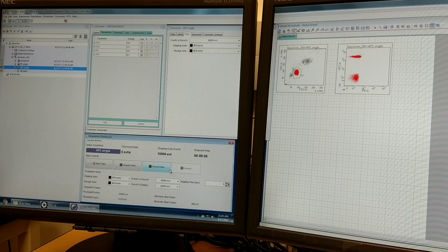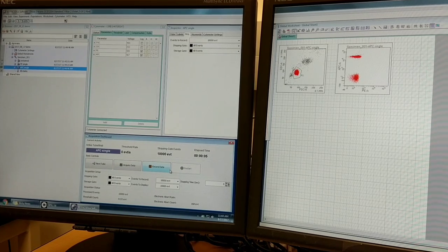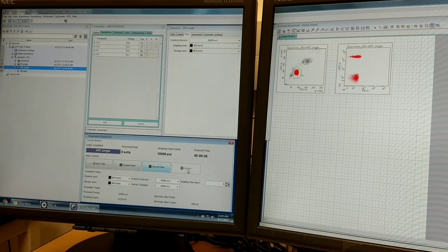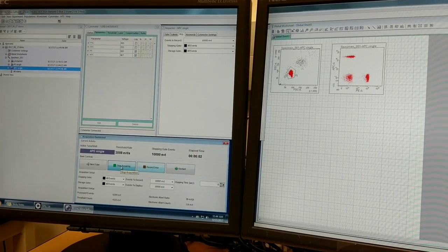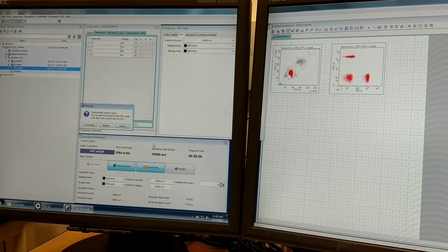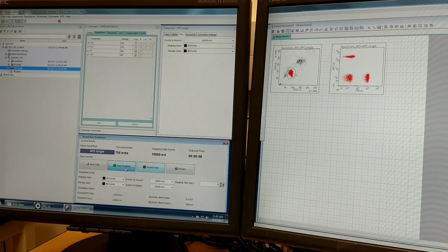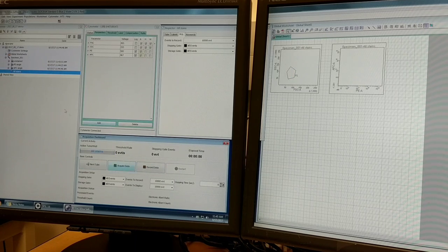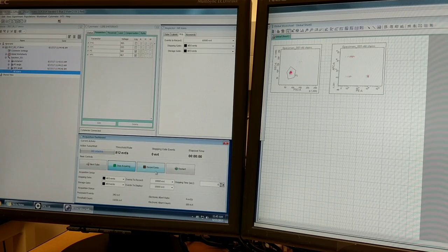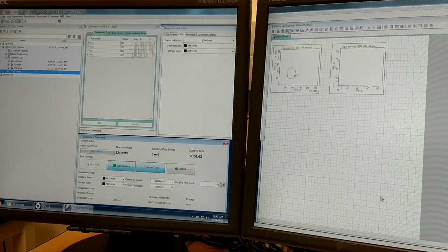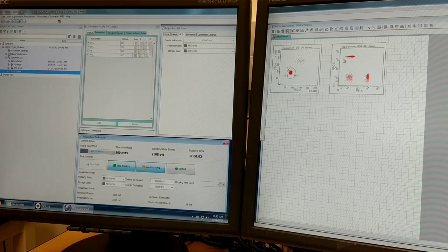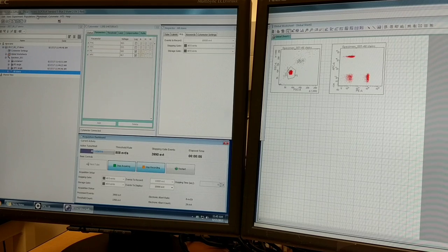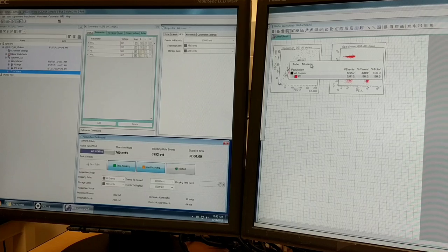And lastly, I'm going to record the tube that has all our stains in it. I'm going to cancel that because I've forgotten to hit next tube. Make sure you have the correct tube highlighted. I'm going to acquire and record.